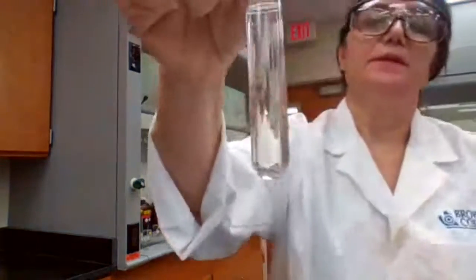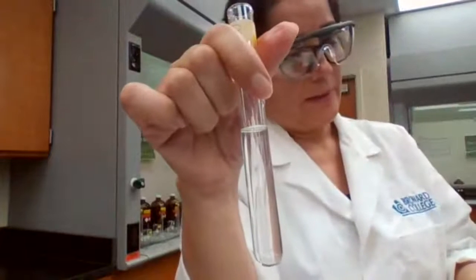Okay, much better, a different test tube. Record your observation. This is just the deionized water.